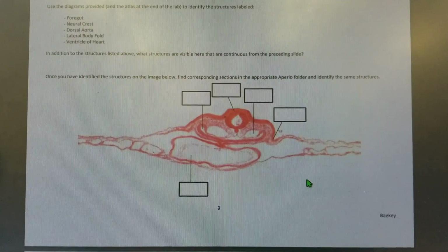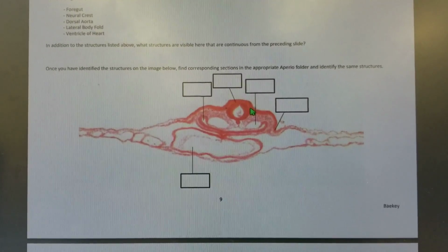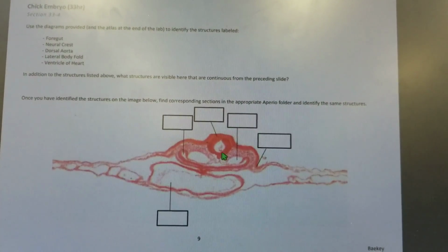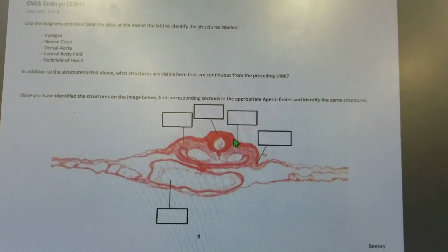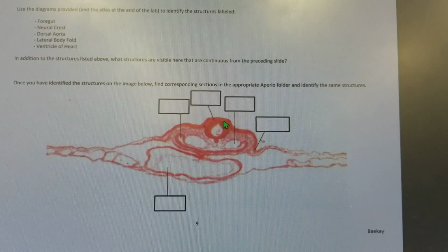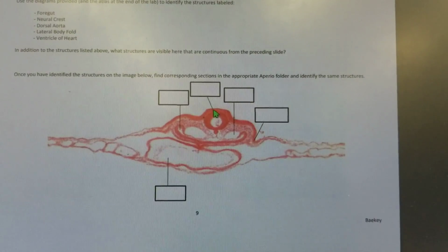Further back to the next specimen, and here we, again, go with what you know, go with your landmarks, right? So major landmarks are going to be notochord, neuroectoderm, right? This is going to be the skin ectoderm here. Okay, coming off of the neuroectoderm right at the top, that's why they call it the crest, are the neural crest cells. When the neural tube forms, it forms a crest of cells called the neural crest.